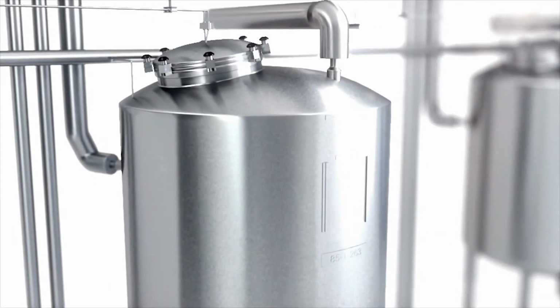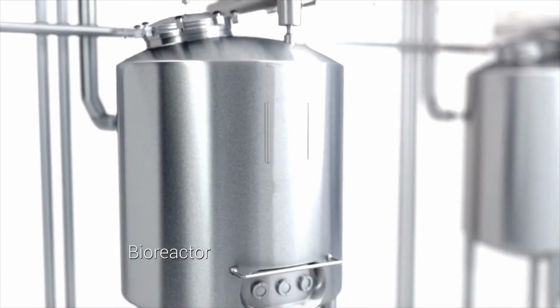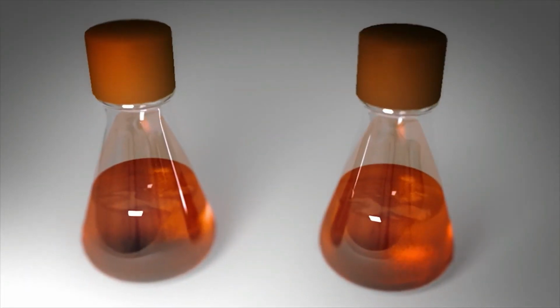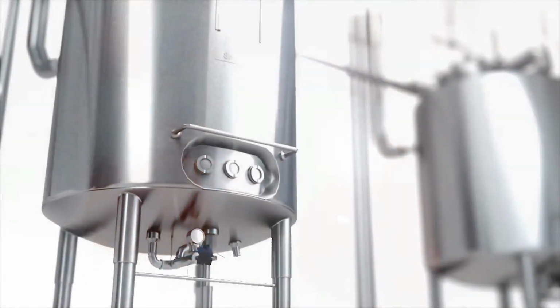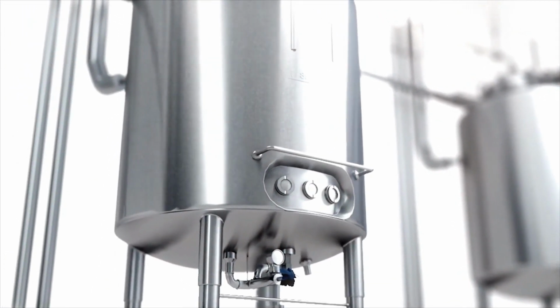Cells producing the protein of interest are grown in bioreactors, which are devices used in commercial production of proteins. Initially, cells from frozen stocks are grown up as cultures in small flasks, and then the cultures are successively scaled up in larger vessels until they reach the large bioreactors, which can be up to 10,000 liters.